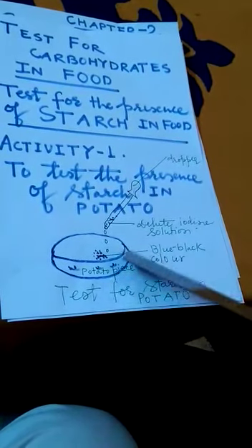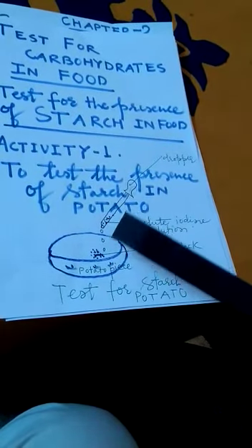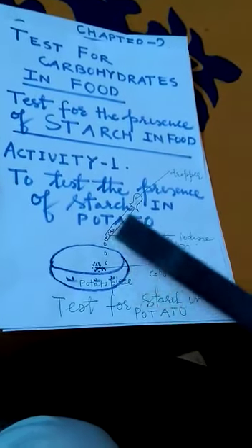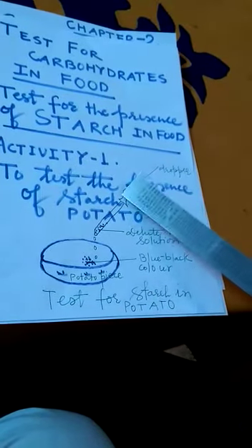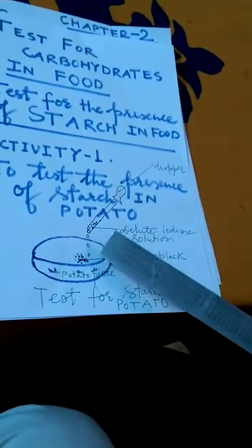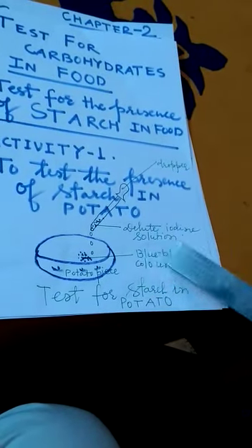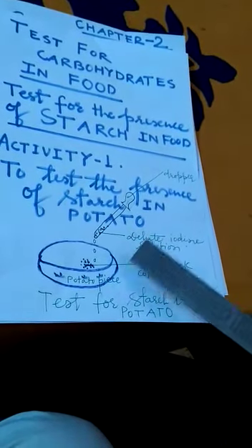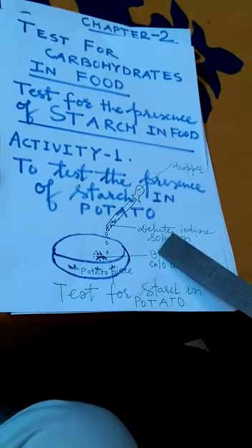Cut a potato into 2 pieces with a knife. Add 2 or 3 drops of dilute iodine solution on the freshly cut surface of the potato piece with the help of a dropper. A blue-black color appears on the cut surface of the potato, and the appearance of blue-black color shows that the potato contains starch. So, starch is a kind of carbohydrate.